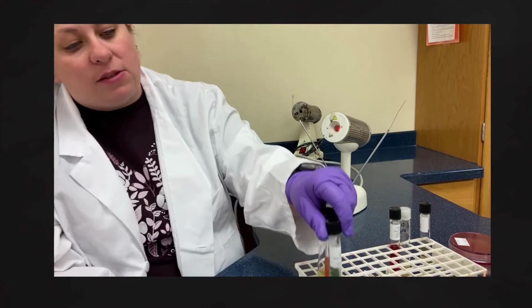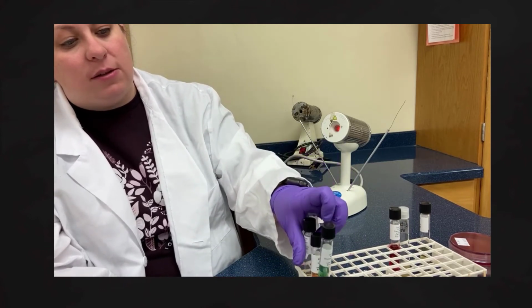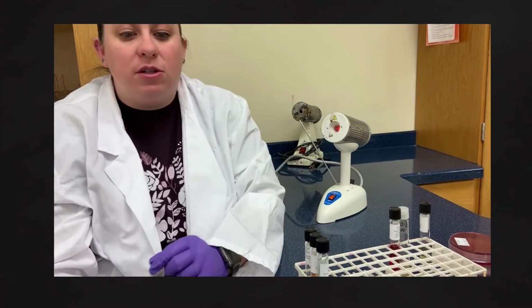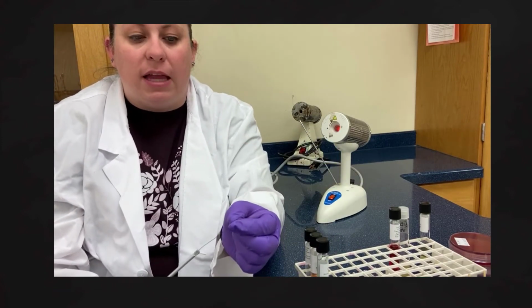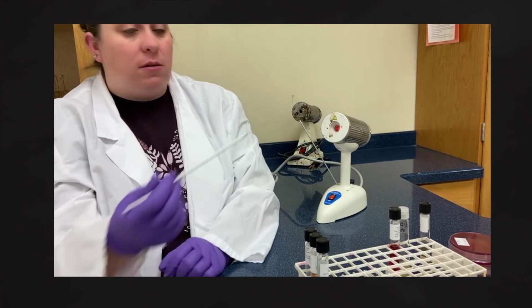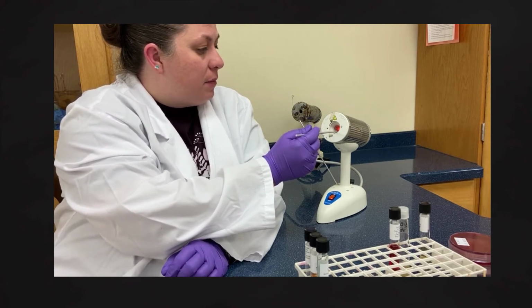All right, these next three that we're looking at are going to be dealing more with a needle. And so instead of using an inoculating loop, we're going to use a needle. It's very similar to our loop, except it's just a straight line. We're going to collect a little bit of bacteria and then place it into the agar. So again, I'm going to sterilize my needle.